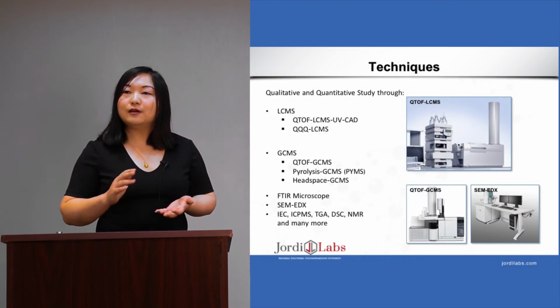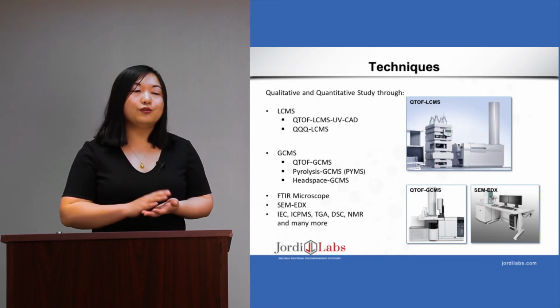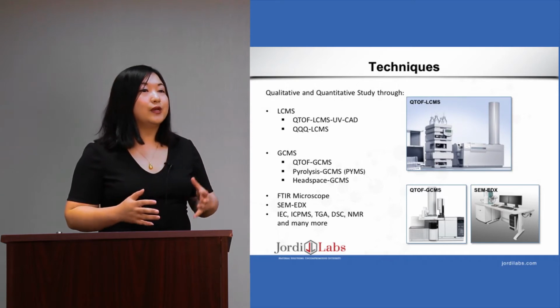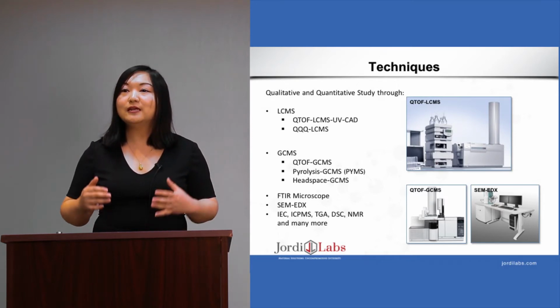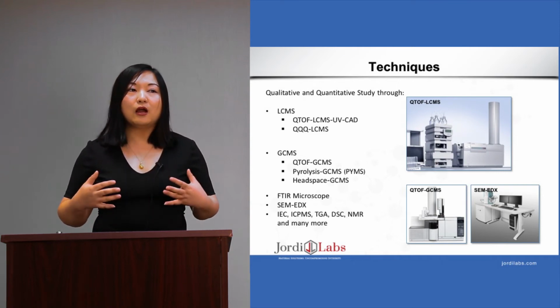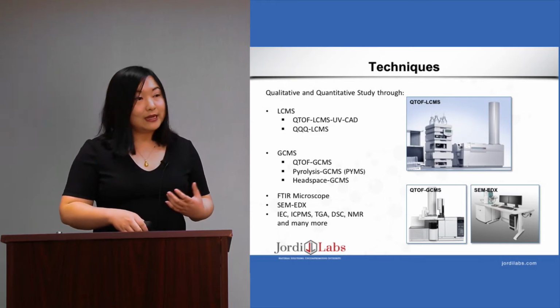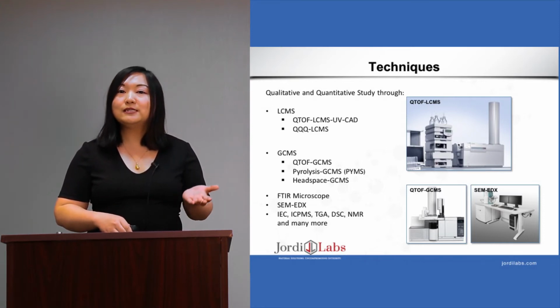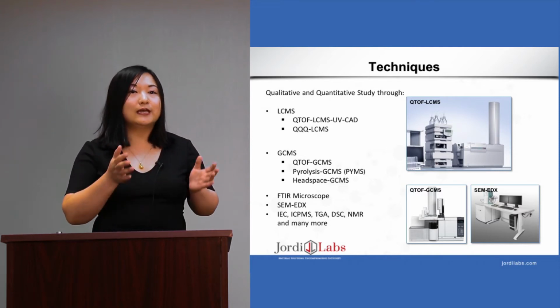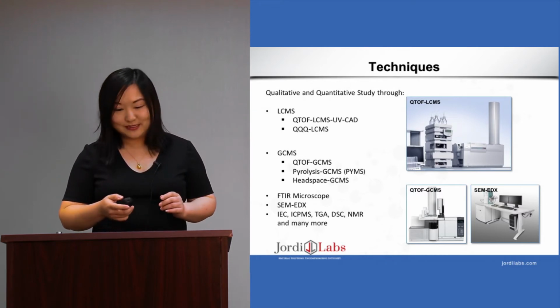While GCMS and LCMS are used mainly for organic compound analysis, we can also use EDX and ICP-MS to analyze the elemental compositions of a product. Another thing we can do here is FTIR, which can give you the bulk chemistry of the product. Later on, I'm going to discuss the utilization of each of these techniques in certain projects and show you how these techniques can be used to solve certain problems.